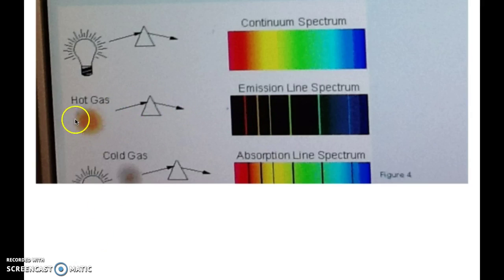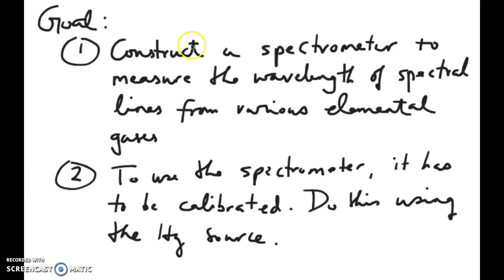We're going to try to use several different sources of light from different elements and we're going to try to see the different line spectra that are generated by these sources of light. And in some cases, we're going to try to calculate or predict what wavelengths those lights are going to be. There are a few parts to this lab. The first one is you're going to construct a spectrometer, which is something that allows you to split the light that comes in and break it into different components.